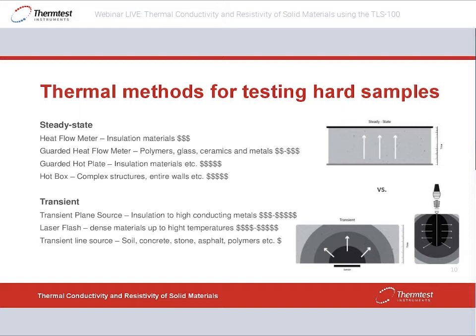We have the laser flash method. It's fantastic for testing dense material up to very high temperature. Of course, expensive and not something that you bring to the field. And then we have the transient line source, which is designed for a more narrow field, but it comes at a very nice price compared to any of these other methods that have been mentioned here.